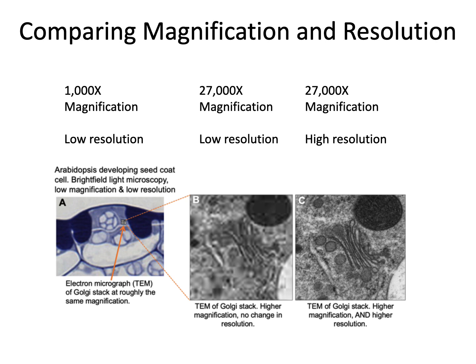What you can really do with electron microscopy is get much better resolution. In the case to the right, you have 27,000 times magnification, but still high resolution, so a lot more information. There you can see those stacked membranes right in the middle, which jump out at me as clearly Golgi, so the organelles can be visualized.